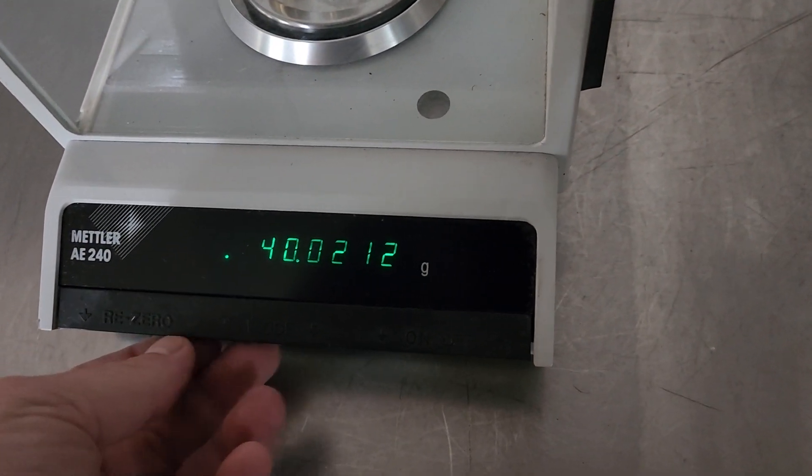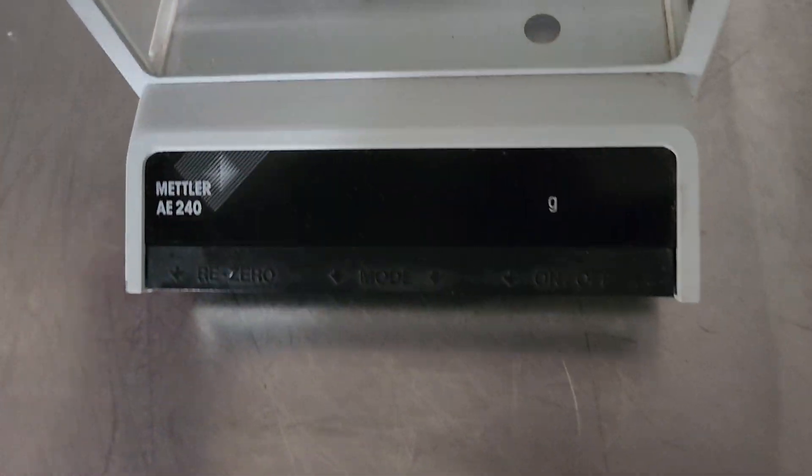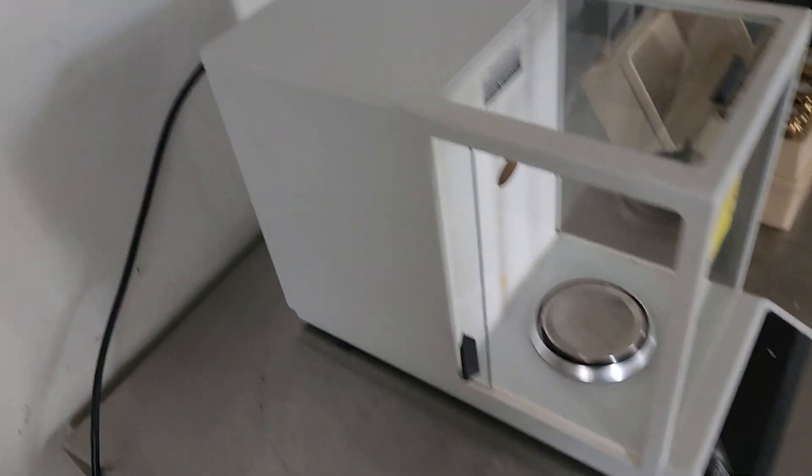It's got this pullout piece here. Oh, I just turned it off. I'm going to flip the lights back on. The display's a little dim, but I think all of these are.